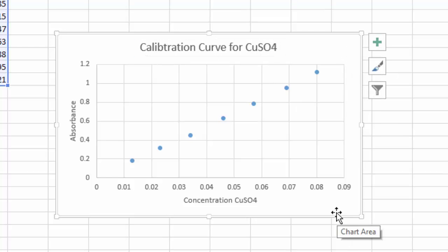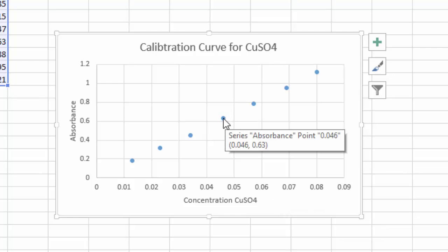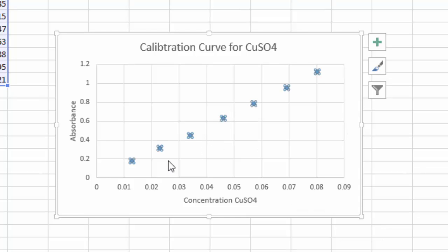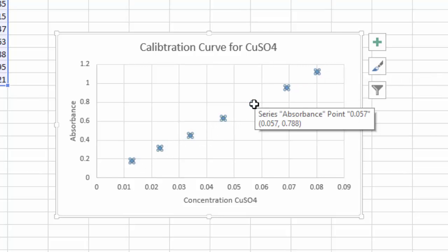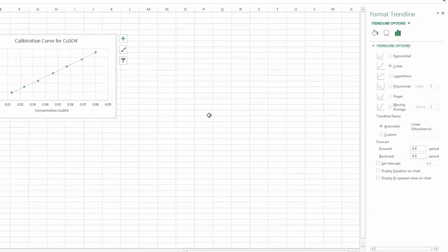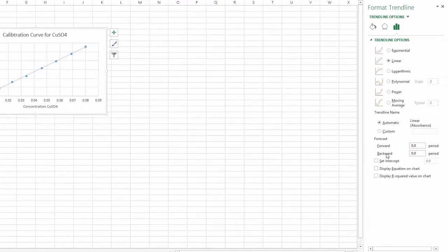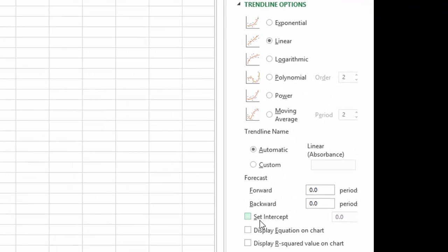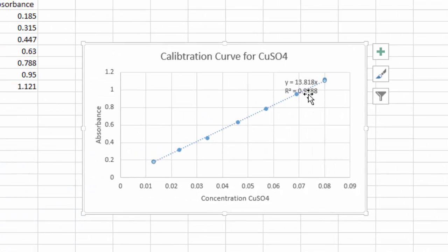The next thing I want to do is left-click on one of the data points so all of them are highlighted, then right-click and go to Add Trendline. I want to do a linear fit, set the intercept to zero, display the equation on the chart, and display the R-squared value on the chart.